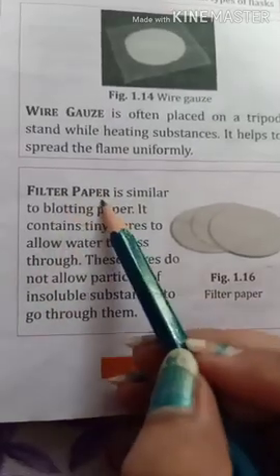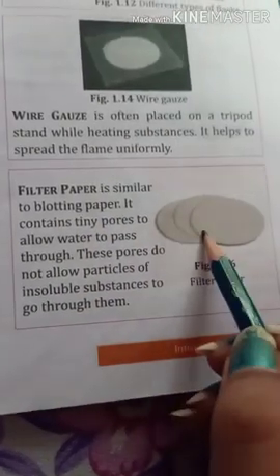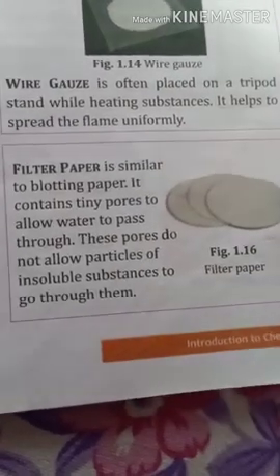Next is filter paper. Filter paper is similar to blotting paper. This is filter paper, and in this filter paper we have tiny holes. Inside this filter paper we have tiny holes like this.